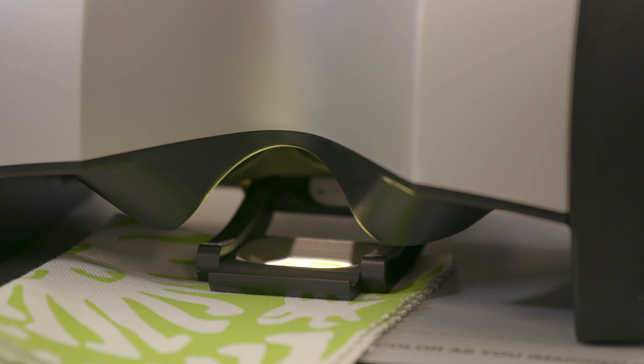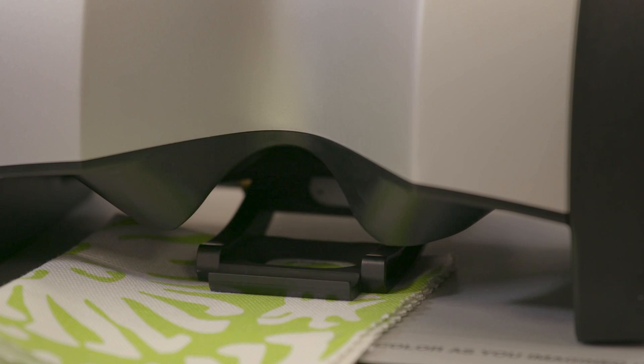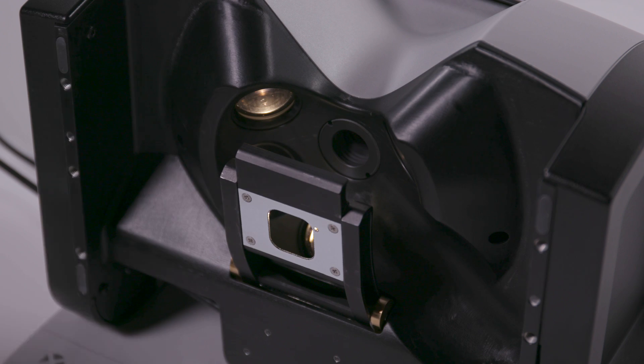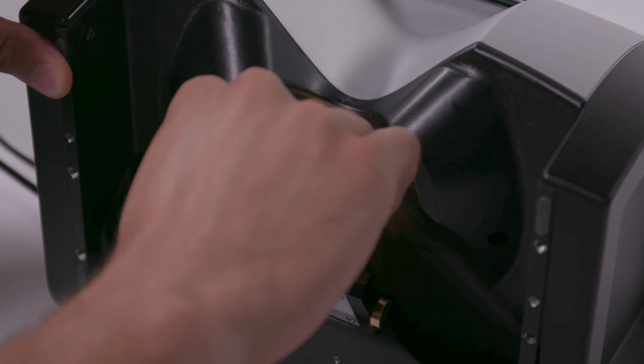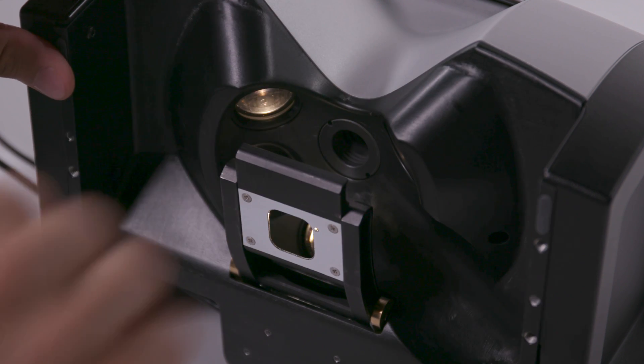Three measurement illuminators keep sample surfaces evenly lit and enable more consistent color matches. The sliding measurement positioner is completely retractable, creating easy access to the lenses for cleaning.